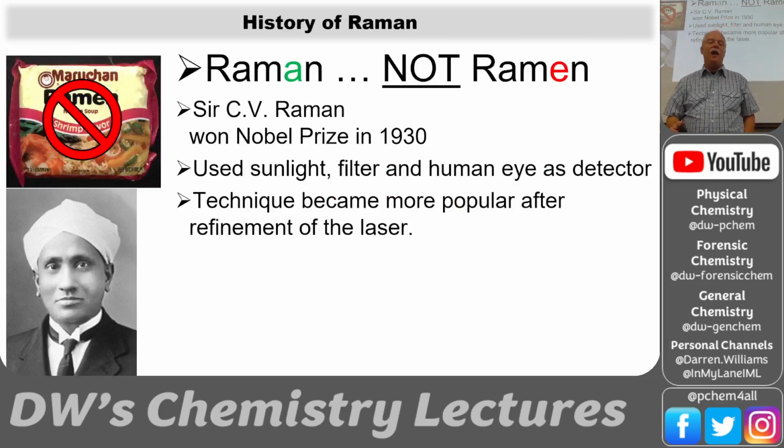So this is Raman, not Ramen. It's not the noodles. Okay. So if you put that in your report, you'll get a nasty little note. Okay. He used sunlight and a filter and the human eye as a detector. So he discovered the technique, and it's been named after him.